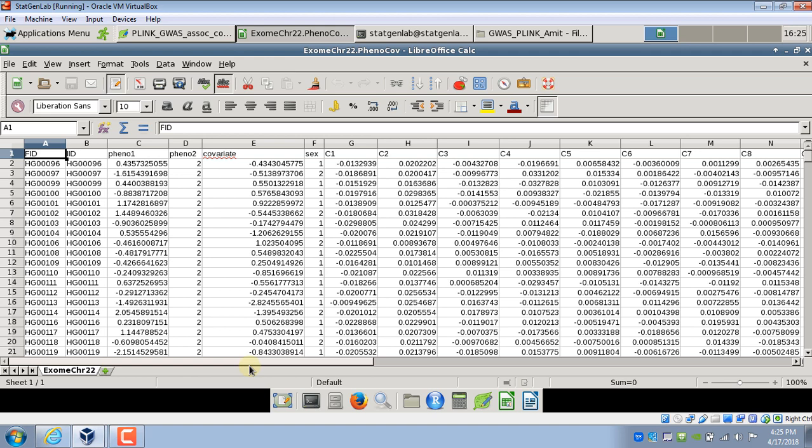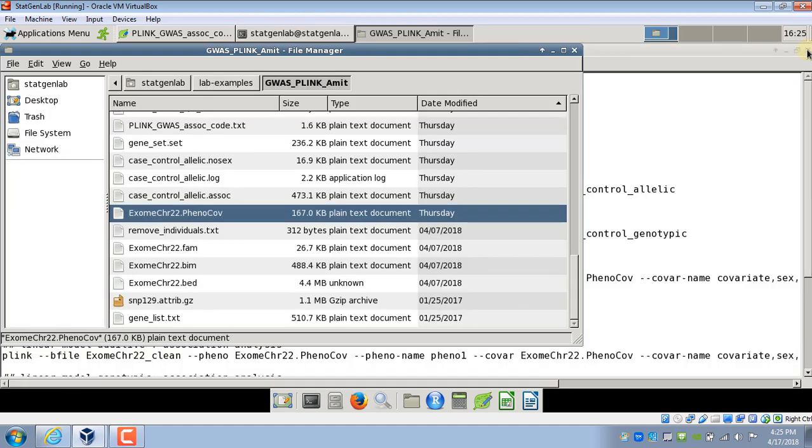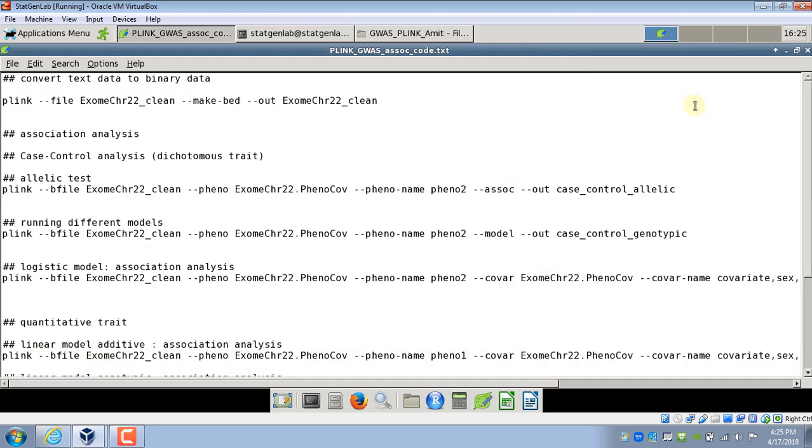In that video I showed how to get these principal components so I'm going to use these principal components as covariates in our model. So this file includes both phenotype and covariate and like I said you can use separate files for them and in today's analysis I'll show you how to call those different files if you have two different files in your analysis.